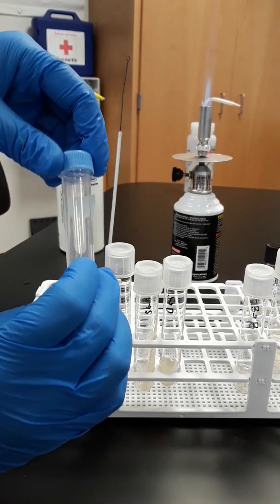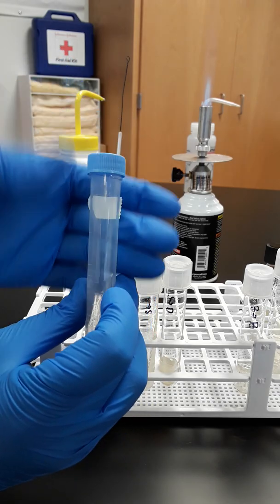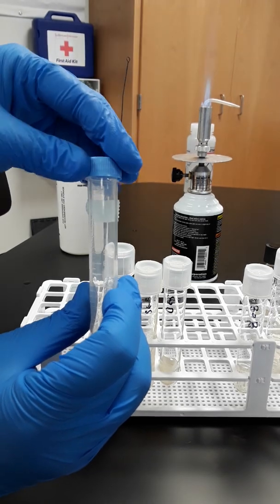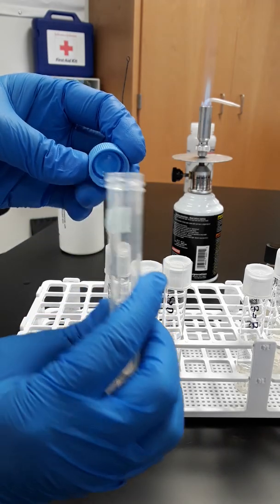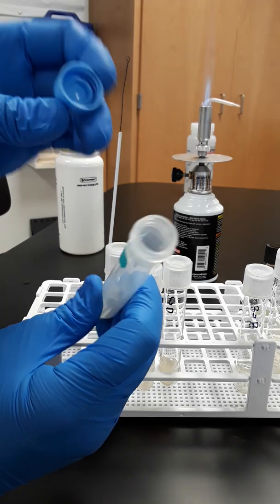So we want to make sure everything on the outside here is something that we can touch. Everything on the outside might be clean, but actually it's dirty. It's not sterile. It's covered with things. The inside, however, is completely sterile. So this inside part of the cap is sterile. This inside of the tube is sterile.